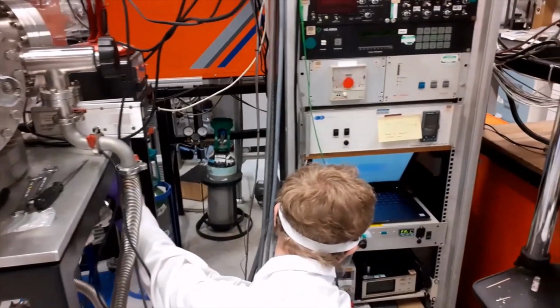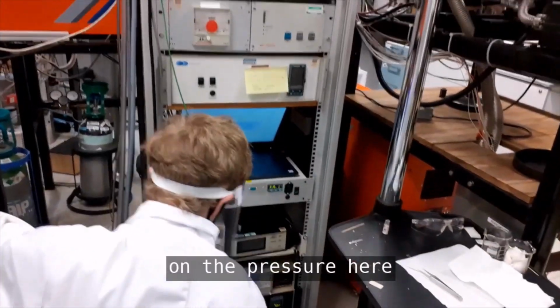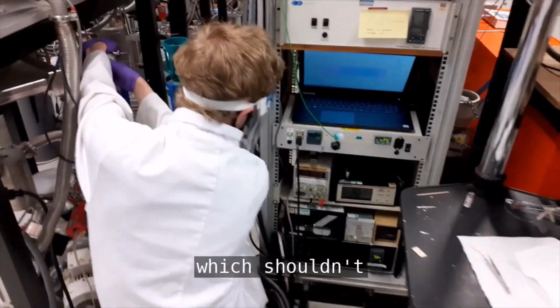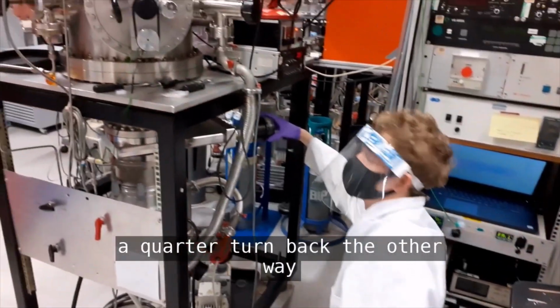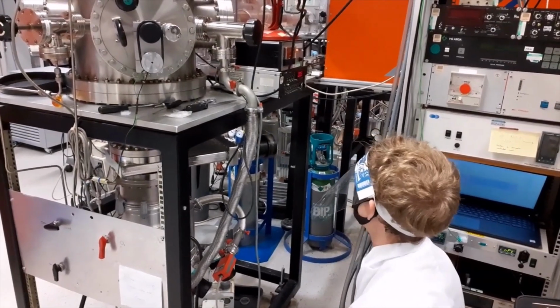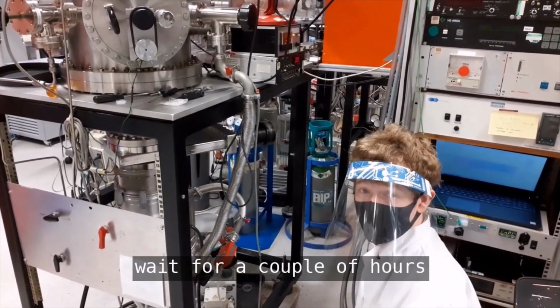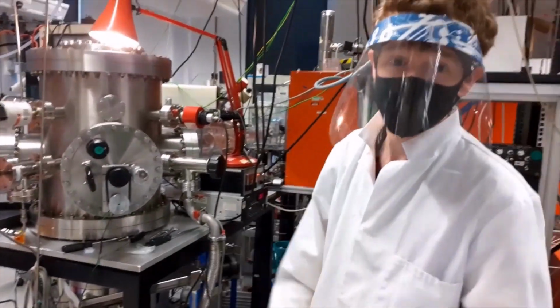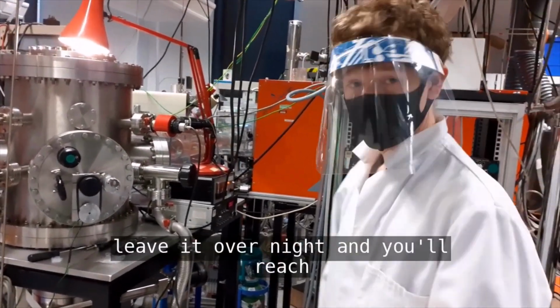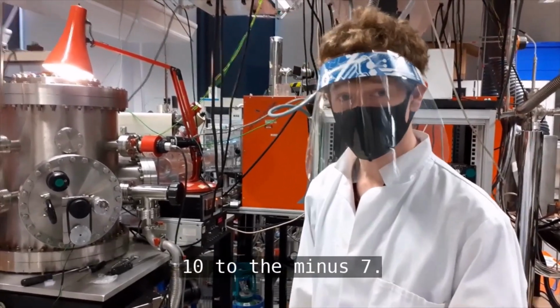And as we do that, we're going to keep an eye on the pressure here, which shouldn't jump up too quickly. So again, we just do it a quarter turn back the other way, and then you're good. Wait for a couple of hours, and you'll reach 10 to the minus 6 torr. Leave it overnight, and you'll reach 10 to the minus 7.